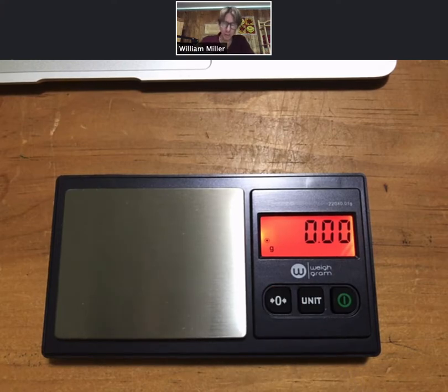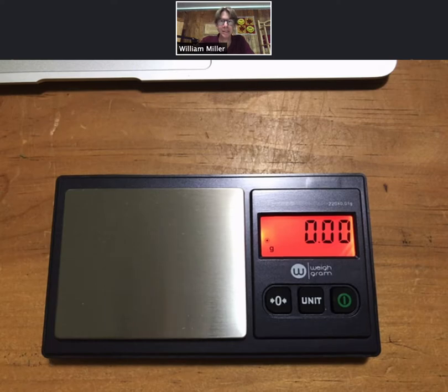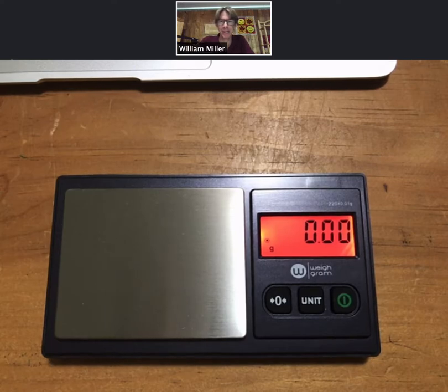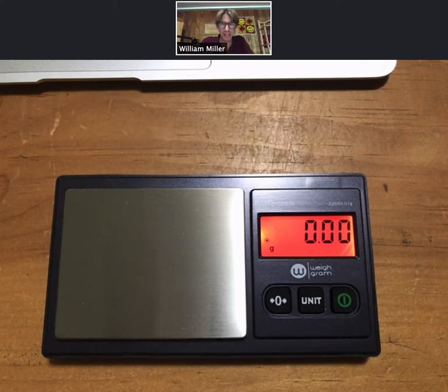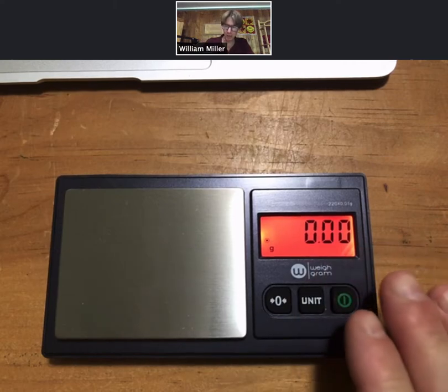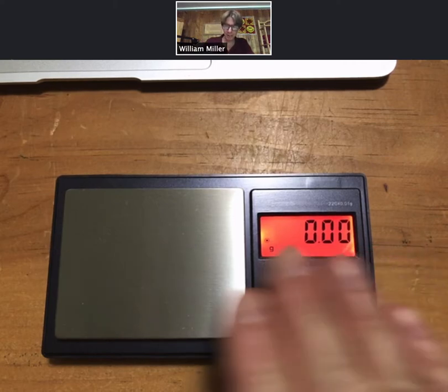If it did not, then you can hit the zero button to get what's called tare, to get it to zero. Now another important thing about this scale is that after two minutes it shuts off, and there is no way around that that I found.